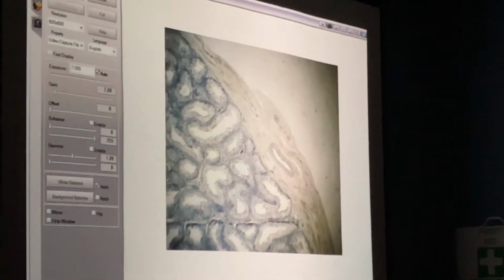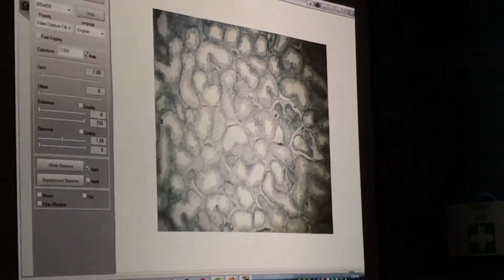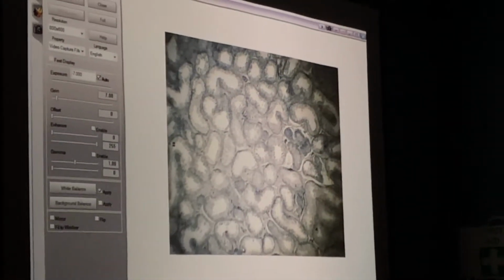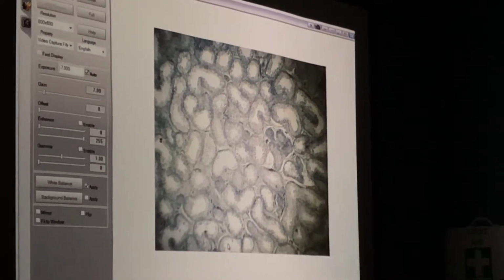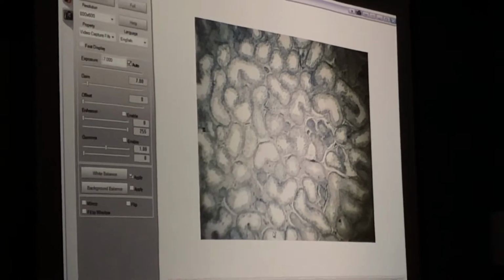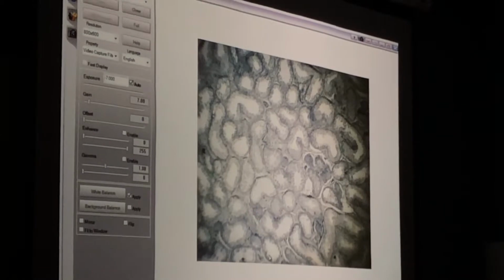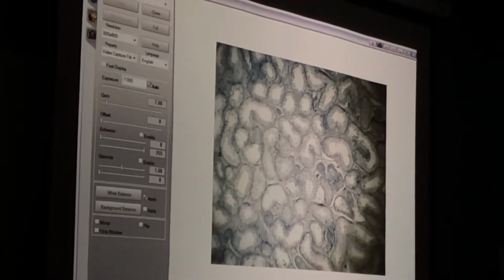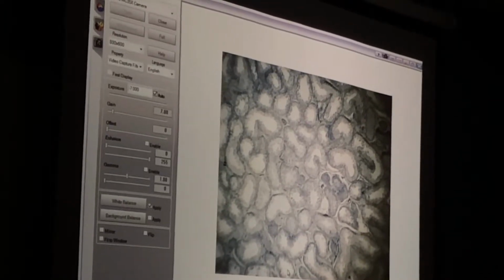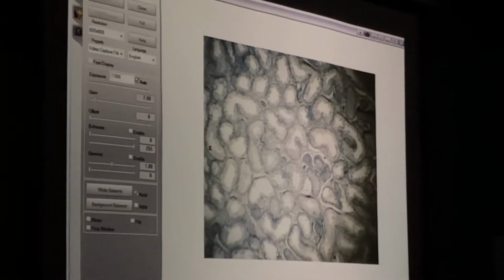And it is going to look like a bunch of tubes, right? So we have lots of slides that have a bunch of tubes. What makes this one different right away is that there are multiple tubes. Instead of just one single loop through, the ones that have single loops are going to be what? The urethra, vas deferens, fallopian tube, right? The testes and the epididymis are both going to have multiple tubes in there. So we should be able to tell the difference that way. Now we just have to figure out if this is testes or epididymis. I already told you the answer, but we'll look as we're going through it.